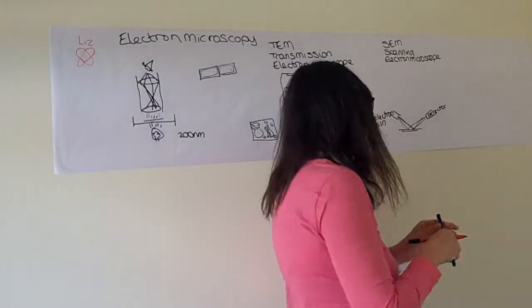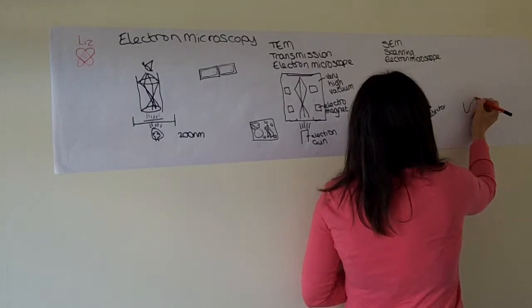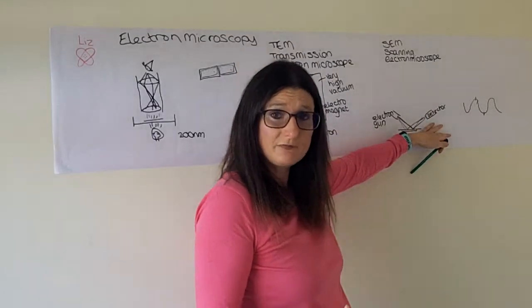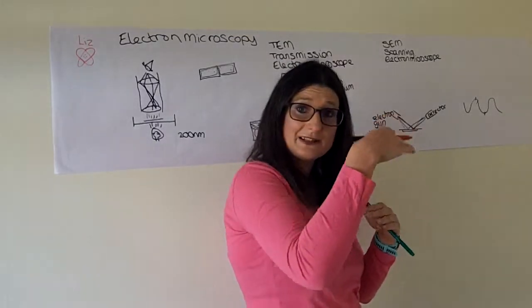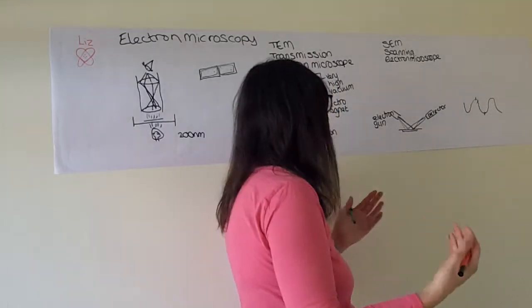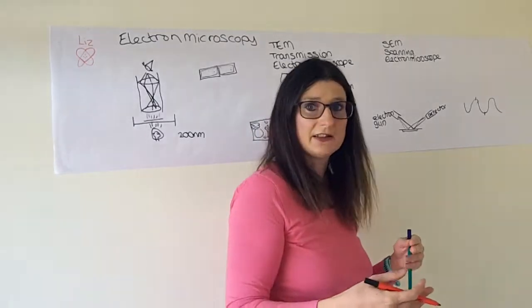whereabouts within the electron's wave, because an electron has a waveform similar to light, whether it's at a peak or a trough or somewhere in the middle, then the computer attached to the detector can tell kind of the depth and angles and things of the electrons bouncing back. So that's all needed to be put together, which is done computationally, and the image calculated.